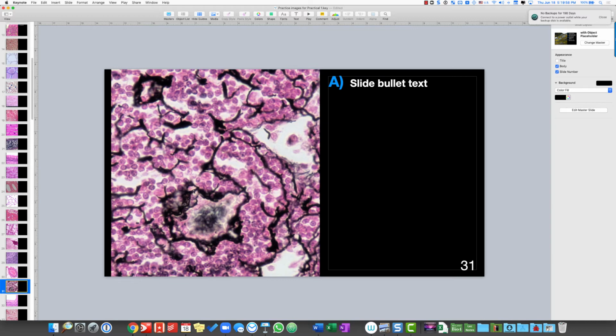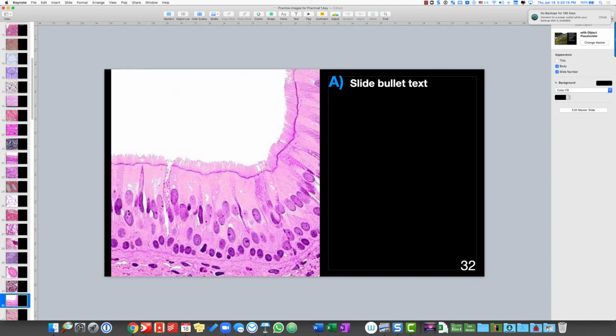This is reticular tissue, reticular connective tissue with reticular fibers. You can tell that these are reticular fibers because these are highly branched in contrast to elastic fibers. And most of these cells are lymphocytes. They are a type of immune cell. This is pseudostratified columnar epithelium with cilia, or ciliated pseudostratified columnar epithelium. Okay, you can see the nuclei occurring at different levels.